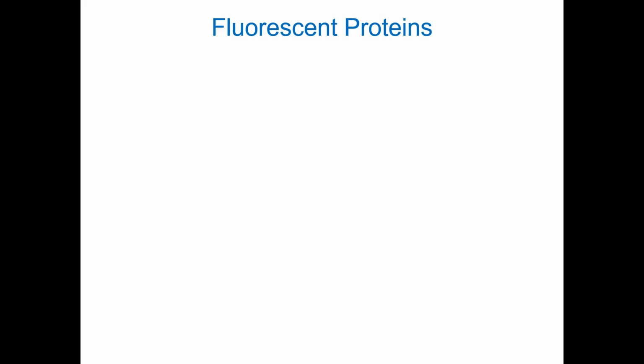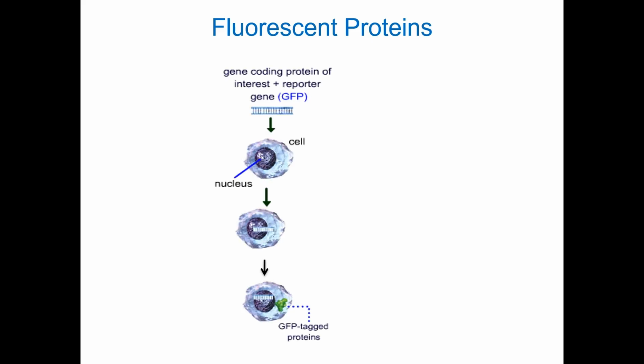Another commonly used application of cytometry is the identification of gene transfected cells using fluorescent proteins. Transfection of genes of interest into cells in order to examine the effects of that gene are not always highly successful. Sometimes as few as 1% of the cells are successfully transfected.